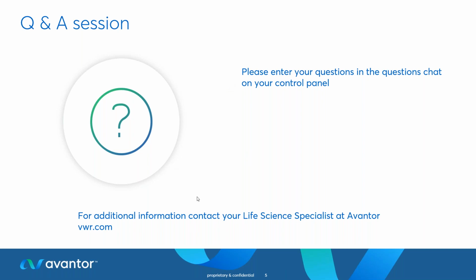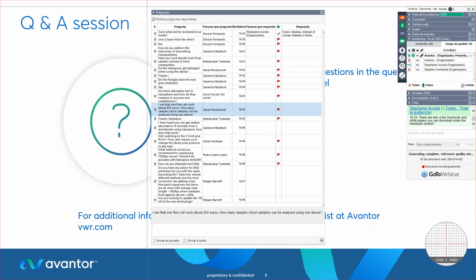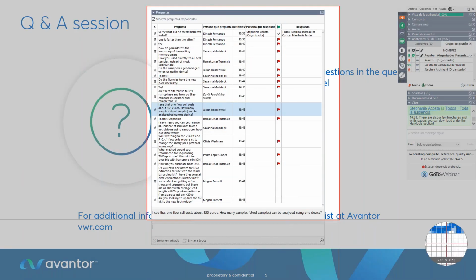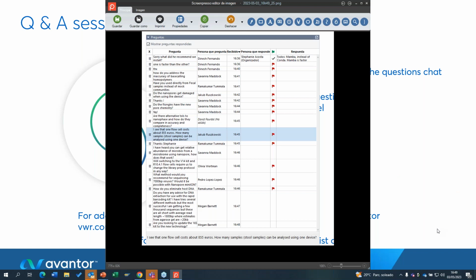Another way you can do that is with adaptive sampling. Let's say you were working on a human genome and you wanted to deplete the human host DNA within your sample. You can upload the human reference genome. You would prepare your sample as normal, as if you were going to do whole genome sequencing, upload the human reference genome, turn on adaptive sampling, and choose deplete.